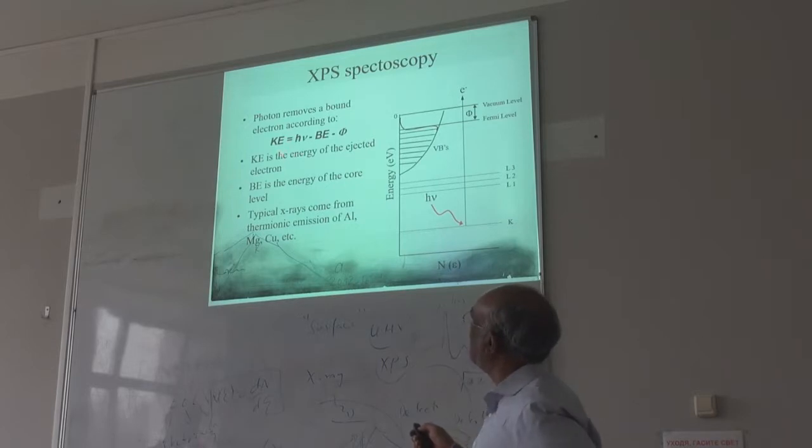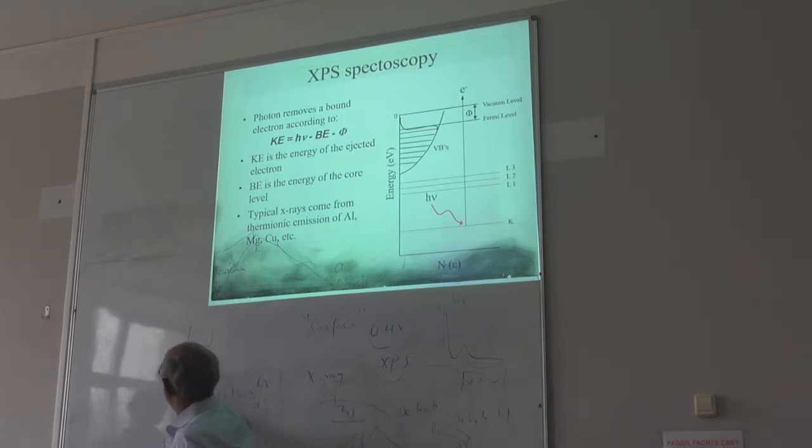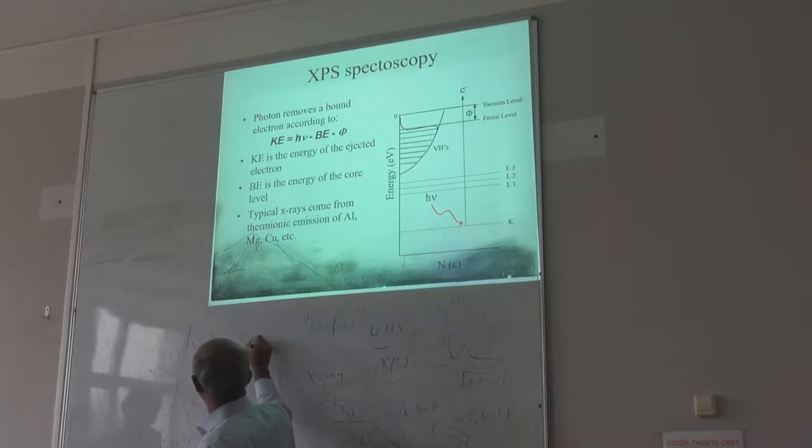You can easily say your h nu, that is the incoming X-ray, should be equal to, first you need to overcome the binding energy, right?